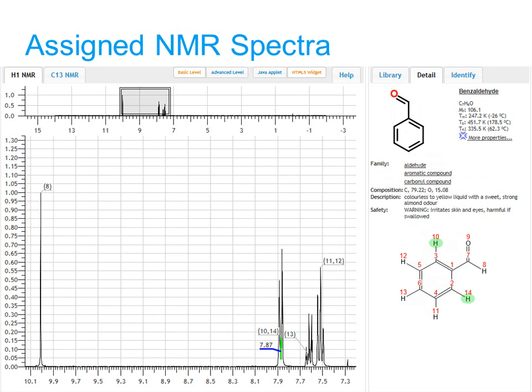This is brand new. The spectra are presently being assigned en masse and are being rolled out. We've started with proton NMR and carbon NMR. We will be extending this in the next few months to infrared, vibrational assignments, mass spec, fragment assignments, etc. So this is brand new work that we've just started to unveil on SpectraSchool under Learn Chemistry.